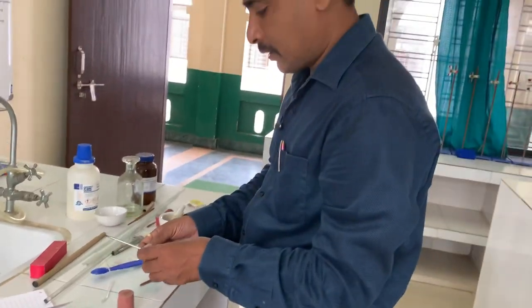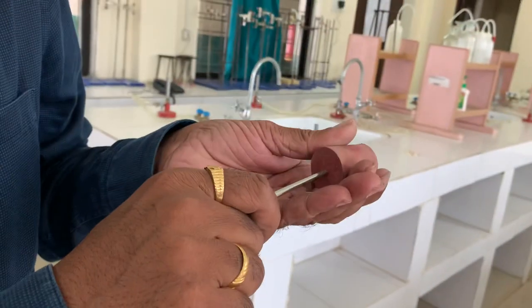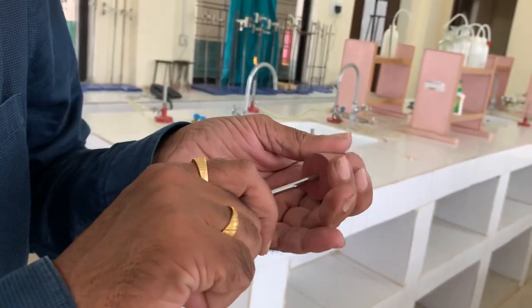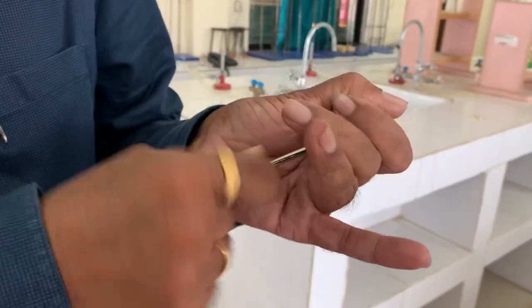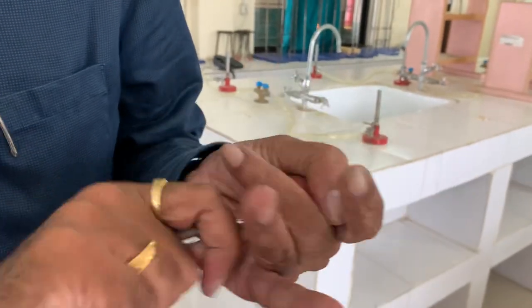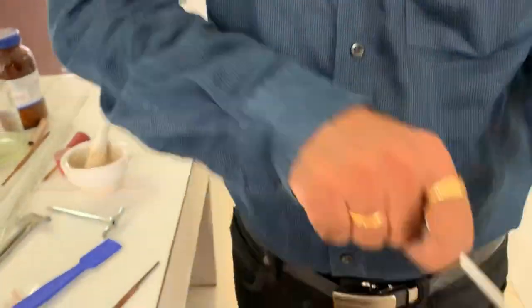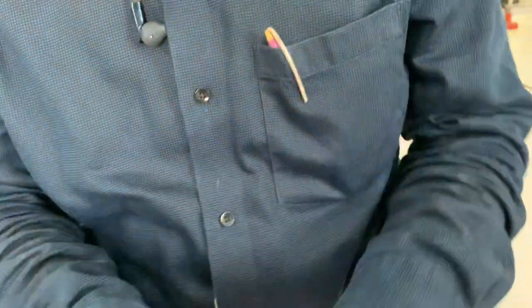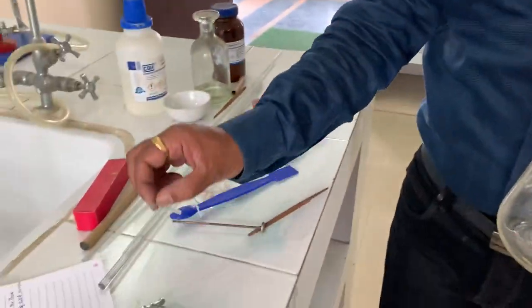At the middle of the cork, you put the cork borer and move your hand like this, and it will cut the cork at the center. It will form a hole like this. This cork with a hole can be fitted in a conical flask or test tube, and you can fit the jet here.